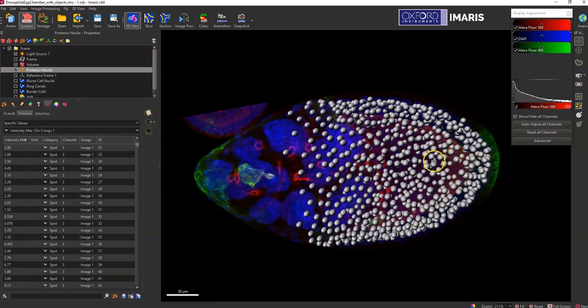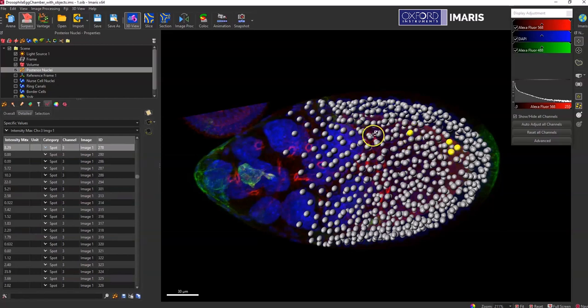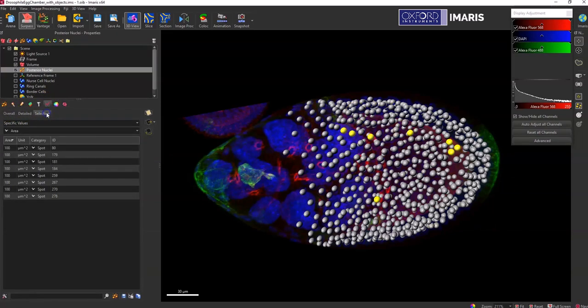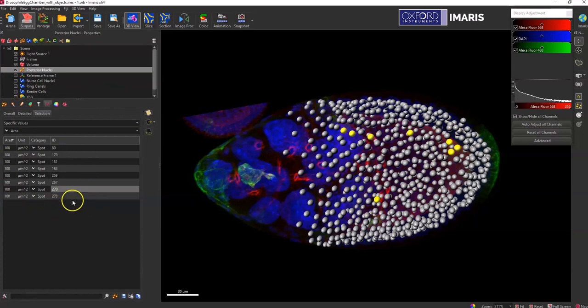You can just select the ones that you're interested in by holding the control key and you can see that the ones that I'm selecting will highlight and turn yellow. I can then in the statistics tab, instead of being in the detailed or overall tab, switch to the selection tab. The ones that I have selected by holding the control key and are yellow will be the ones that are populated here.